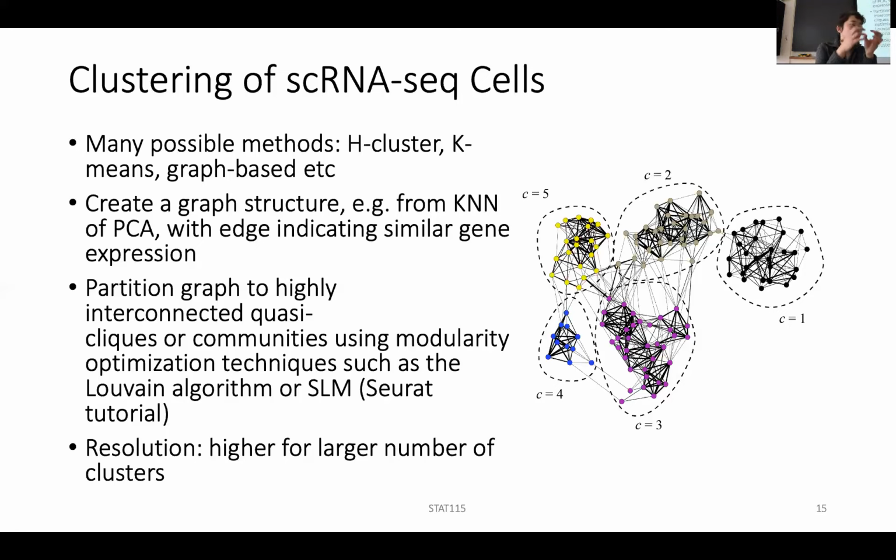So if this one immune cell has different expression, is that the same cell, just different expression, or is it a different lineage already? Because you look at the T cells, how they differentiate. At some point, they're called different cell types now. Where do you draw the line? It's unclear, right? So when you do the clustering of some cell population, you have to also decide how many clusters you want. So the parameter resolution is something you can tune.